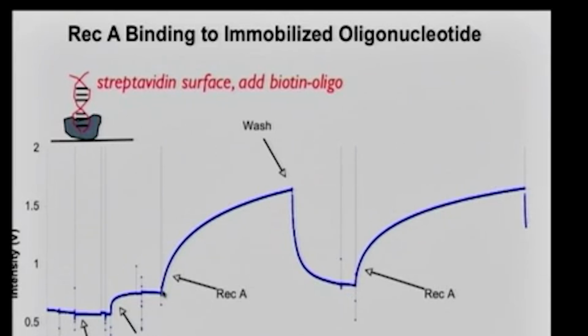And you can actually analyze these curves to measure the binding and unbinding kinetics of RecA and DNA. So this will be similar to what we're talking about in SPR, right? Like in terms of on rate and off rate. That's right, similar. So this is an on rate and off rate of RecA onto DNA. Now, similar both here and in SPR, one has to put together the correct model in order to extract the correct kinetics. So I think the software plays a role there, like how you best fit the model and extract the data.